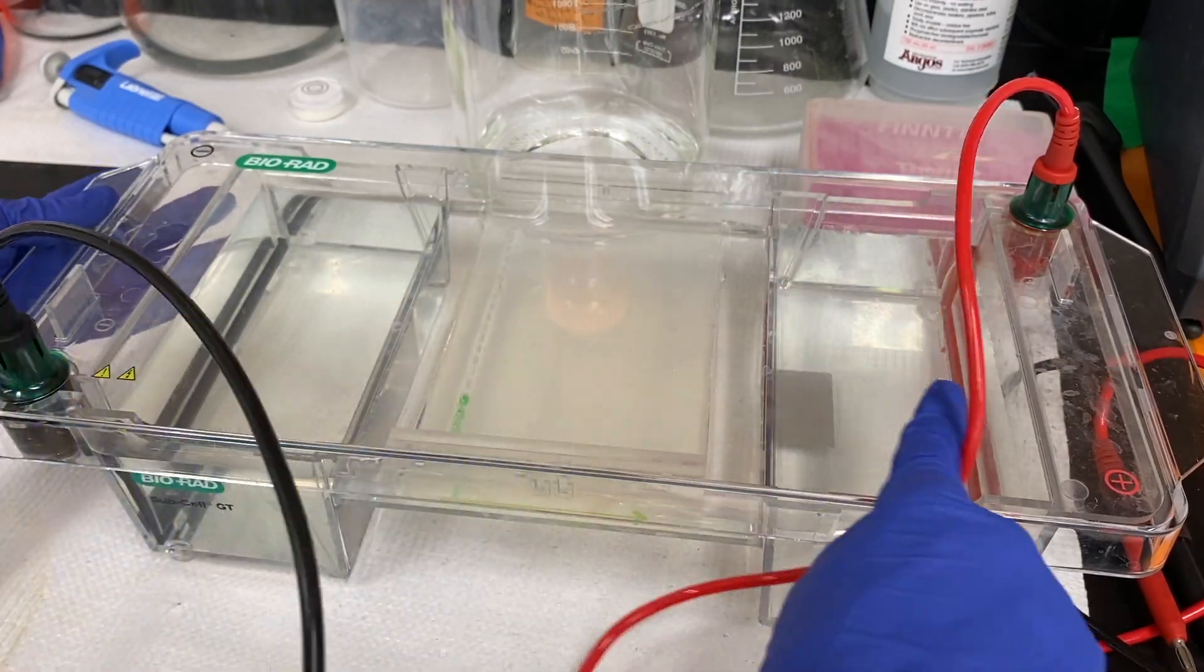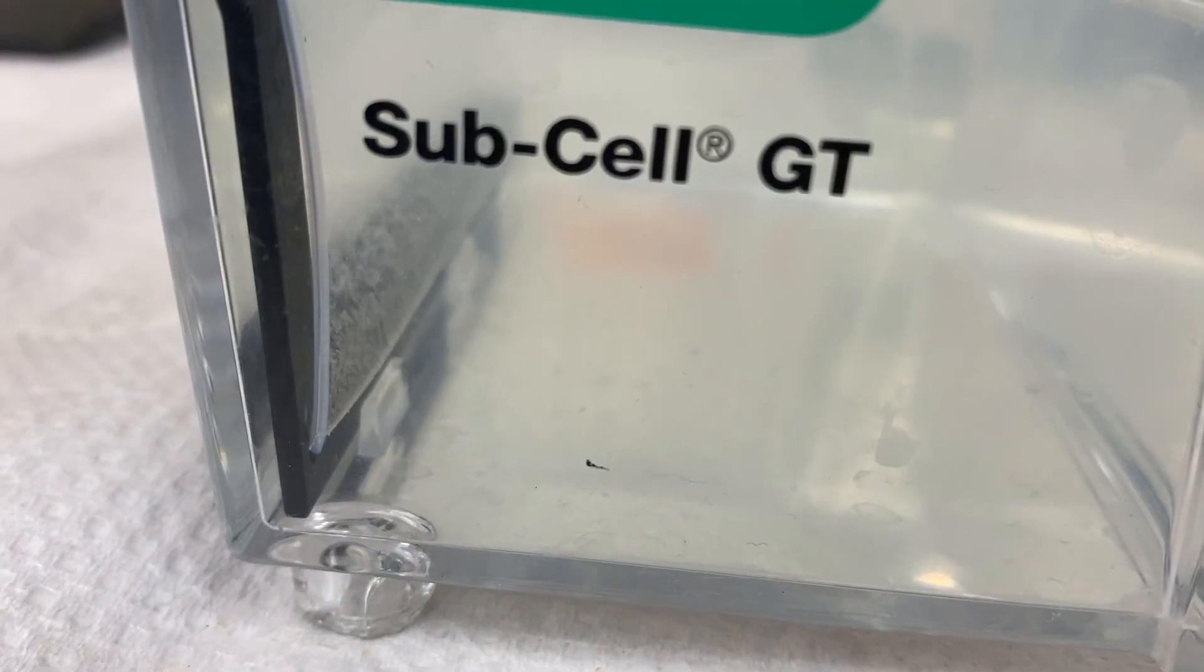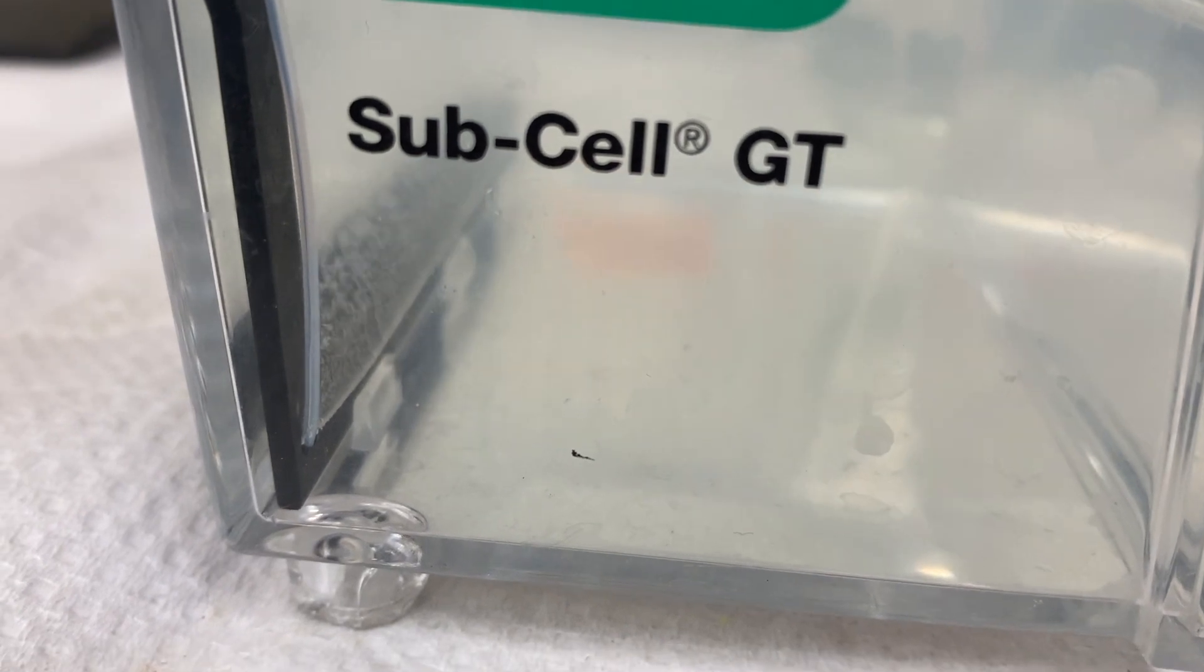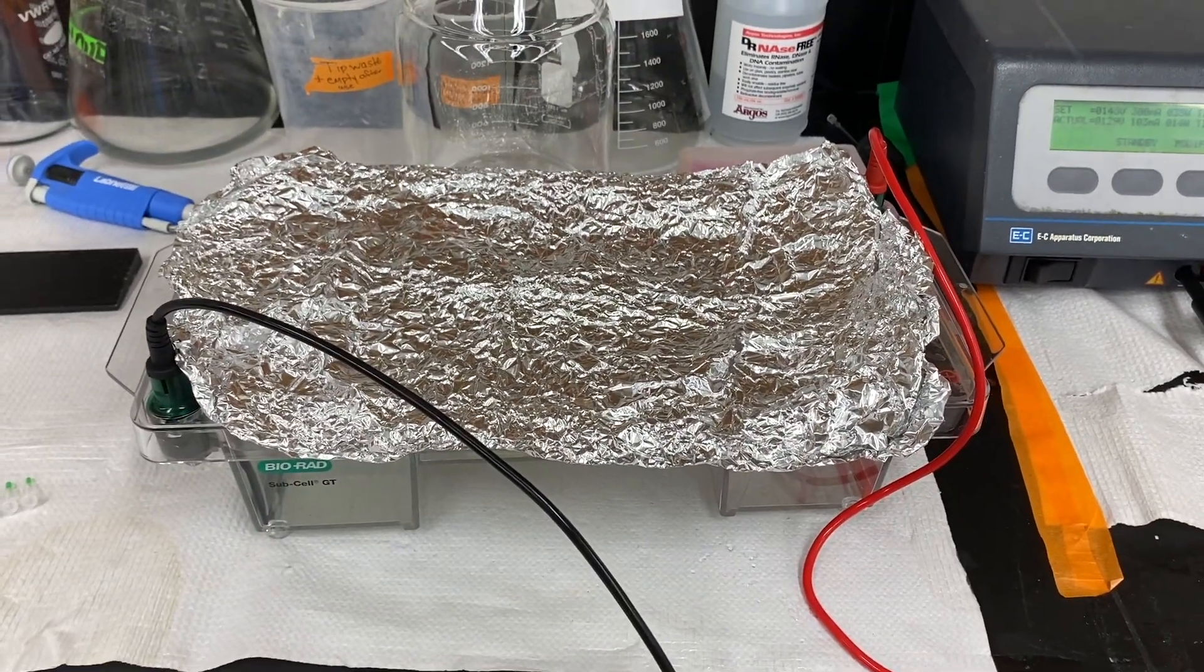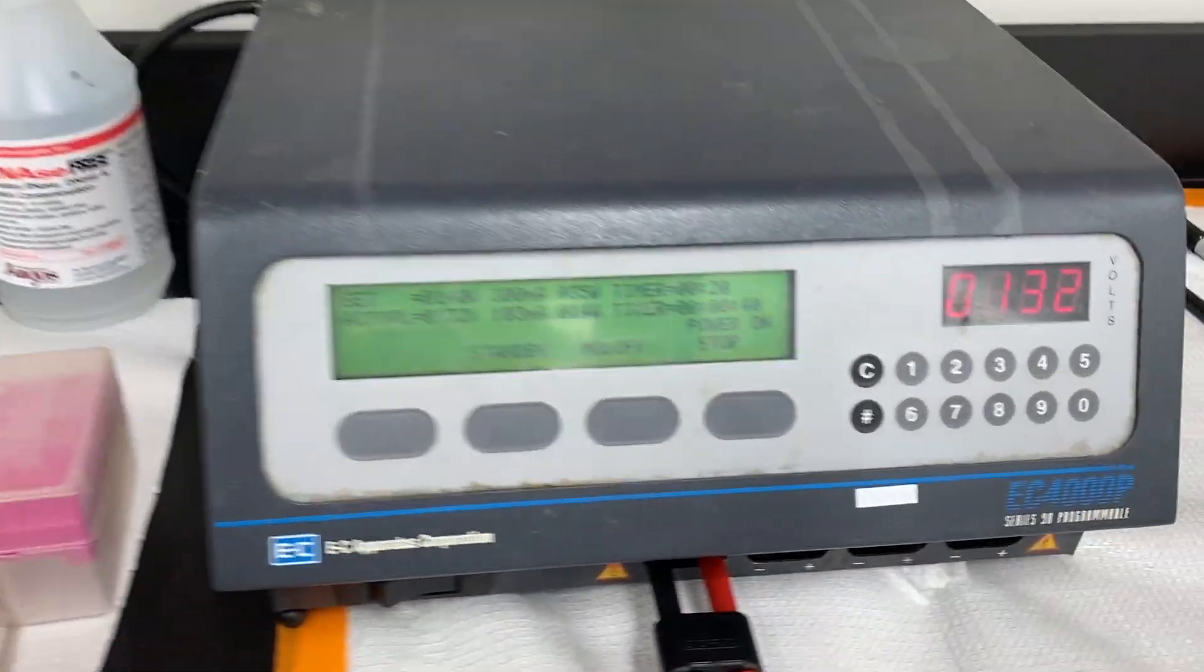That way the charged particles will flow in the correct direction. Once I start the machine, I can actually see the charged particles leaving from the negative end. So I go ahead and cover it with a tin foil lid and let it run for about 20 minutes.